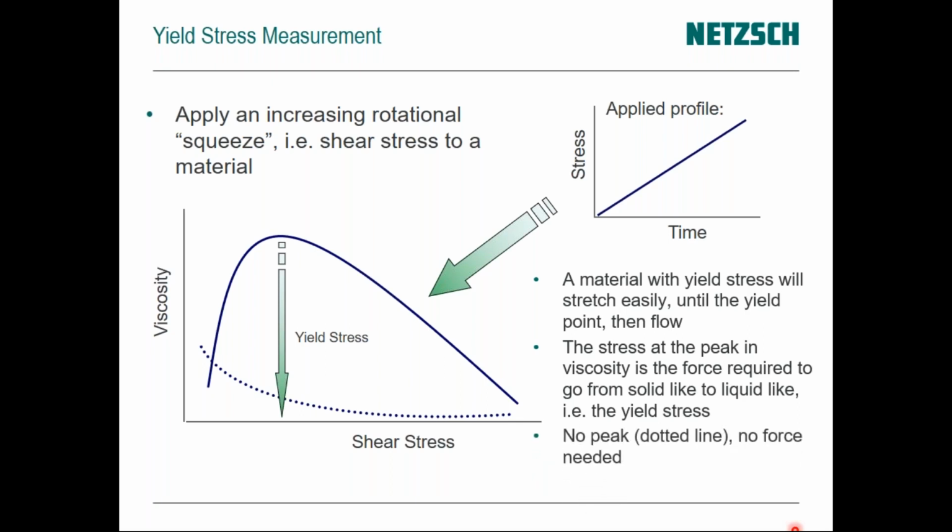So this is a great quick test. It just takes a couple of minutes to run, and it can show you a lot of useful information. How this yogurt is going to feel in your mouth, for instance, is related to the yield stress.